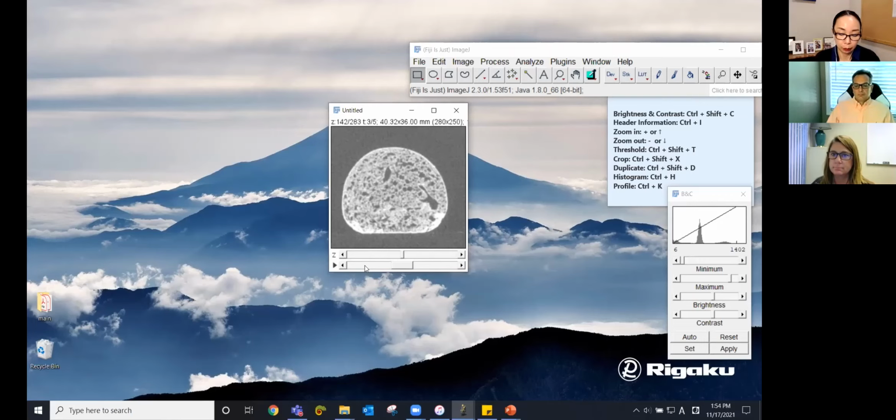Now, the last question is, what do we call this, terminology-wise, in ImageJ? All right, so time to vote one last time. Is this called a 4D stack? Is it called a hyperstack? Is it called a super stack? Or is it called a super hyper duper stack?